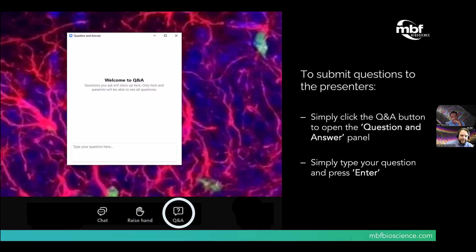See another question here about whether other tissues can be cleared too? Yes, it's not just mouse brains that can be cleared. Many different tissues, many different organs. I've seen customers clearing bone, even decalcifying bone and clearing that as well. We've imaged hearts, lungs, kidneys. The possibilities are really endless, and it's just about finding the right clearing technique for your experiment.